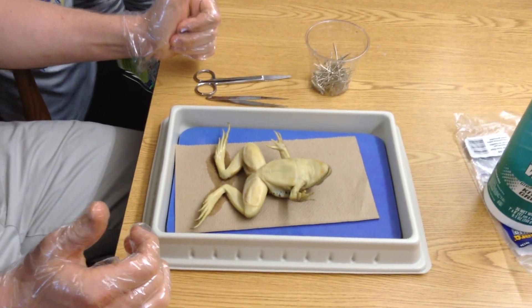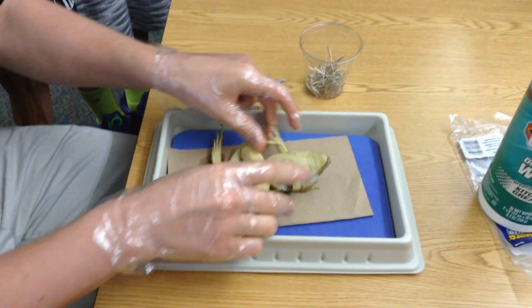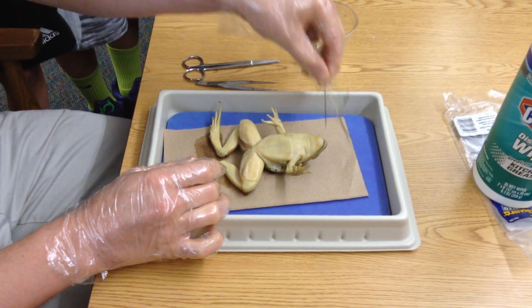I think I got everything I need. Should be good to go. Frogs are different sizes — I try to pick an average-sized one. So you're always going to start with the stomach facing upward. We need to begin by pinning it down.